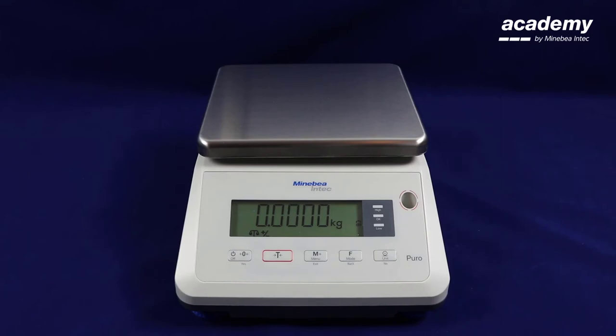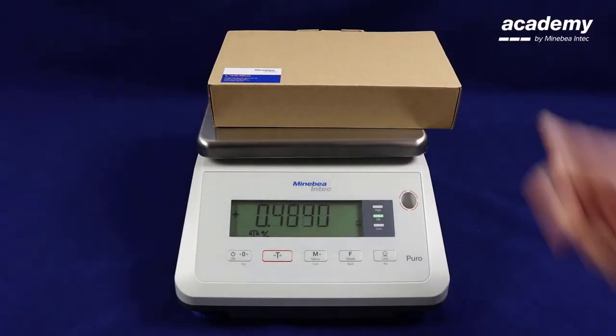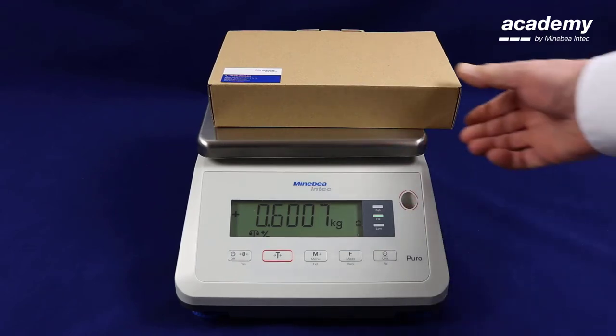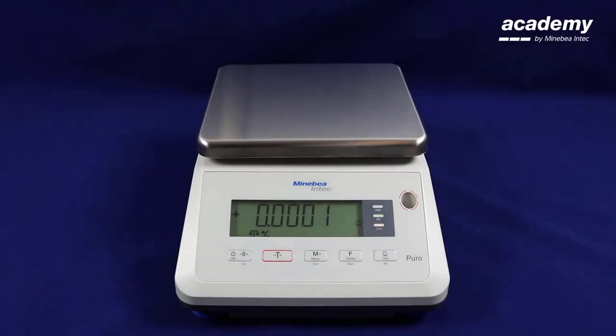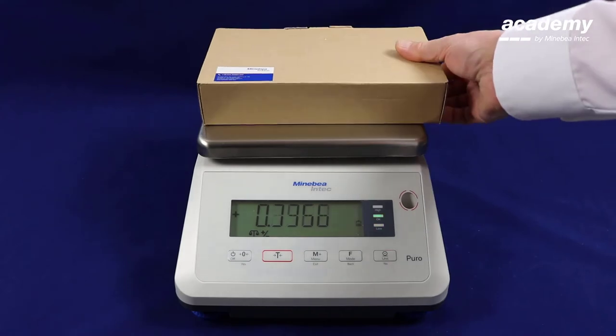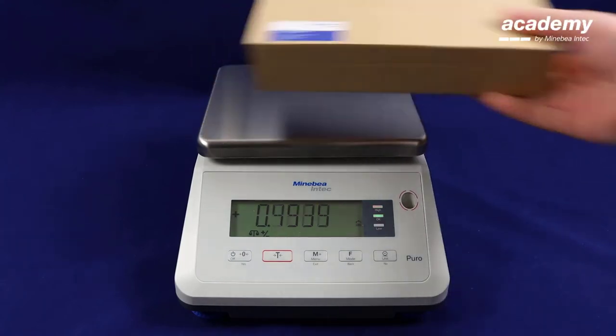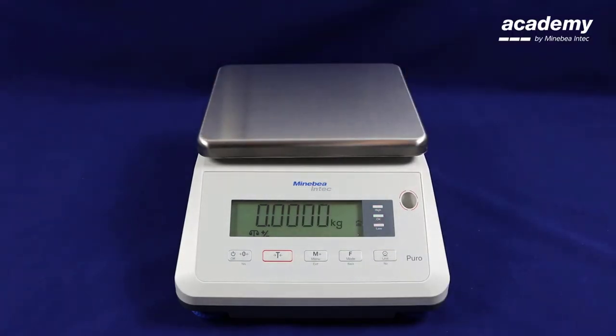This will take you straight into the application where you can start your weighing. As you can see a sample has been placed on the weighing pan. As this falls between the upper and lower tolerances the check weighing light is showing green. The next sample is outside of the upper tolerance and therefore is showing red.